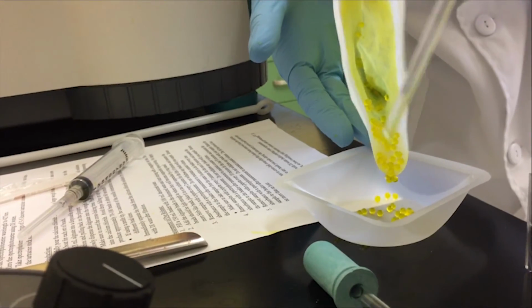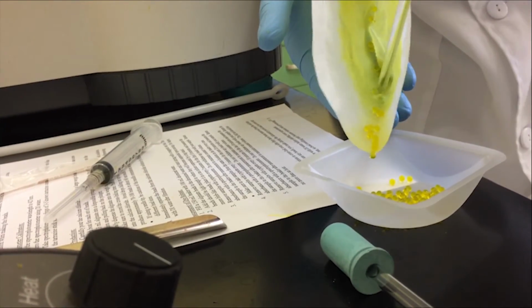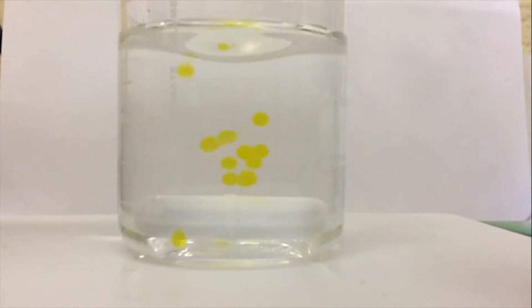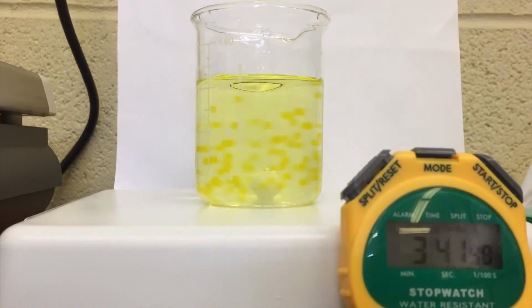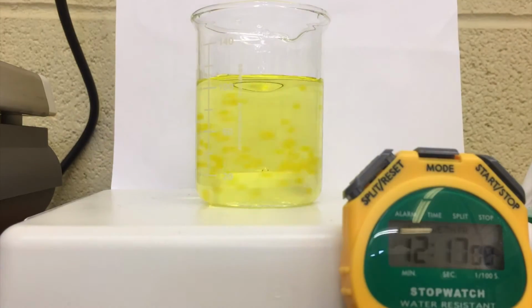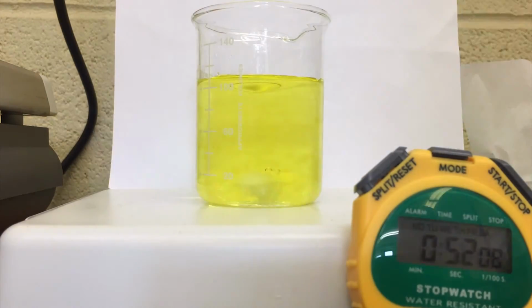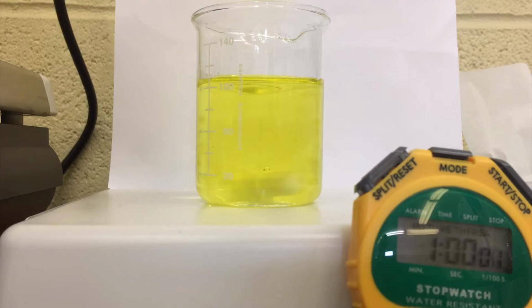Once the beads had slightly dried, they were added to a beaker of deionized water and mixed at a constant rate by a magnetic stir bar. A stopwatch was started as roughly half of the beads were added to the beaker, and water samples were extracted from the beaker every 2 minutes. These samples were analyzed in the spectrophotometer before being added back into the beaker so that the volume would remain constant. After 10 minutes, samples were gathered every 5 minutes, and after 30 minutes, samples were gathered every 10 minutes until an hour was reached.